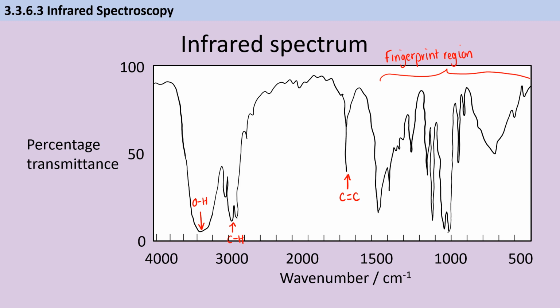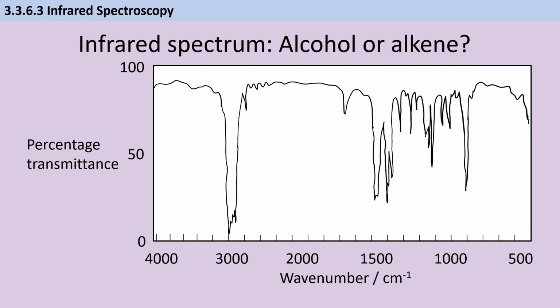And then which one of those fingerprints matches. You're also going to see questions in the style of this one, where you're asked to say whether a compound fits into one homologous series or another, and then justify your reasoning. So here we're asked, is this one an alcohol or an alkene? There's lots of information in this spectrum that we're not interested in right now. I could identify carbon-hydrogen bonds, but that's not useful information because both of these could have carbon-hydrogen bonds. So all I really care about is, does it have a hydroxy group in an alcohol, or does it have a carbon-carbon double bond?